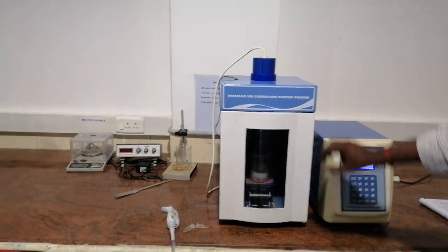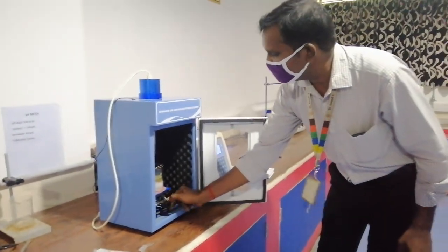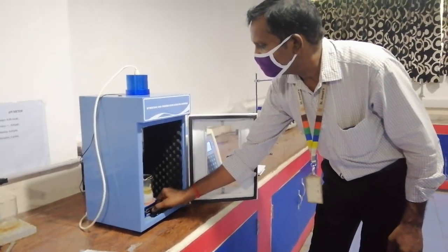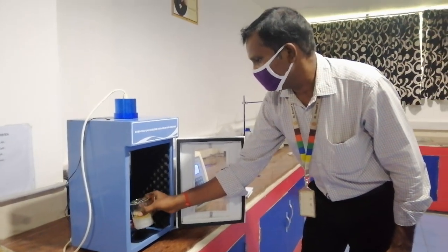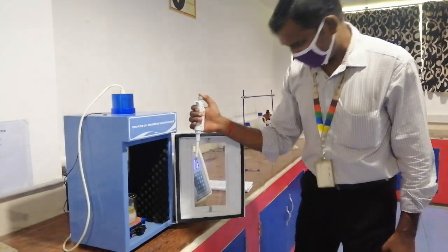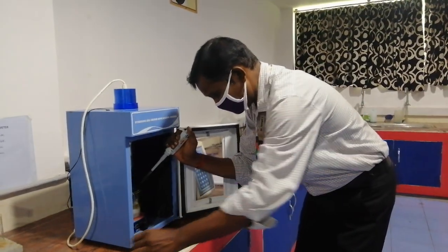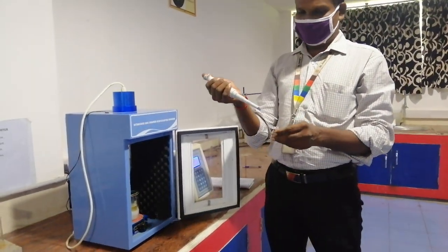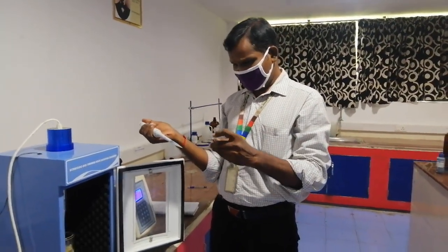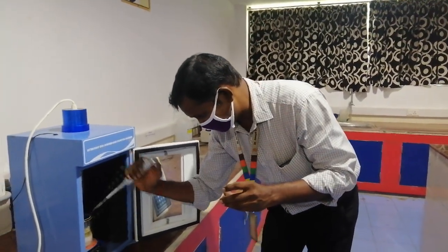Now the second cycle is over. Then open the door and lower the platform. Then take out your sample, or you can simply keep it inside and use your micropipette to collect the sample. So now we are taking the sample for the second cycle. Using a micropipette, you can collect the sample and take it in an Eppendorf tube. Mark it with serial numbers 1, 2, 3, 4: after the first cycle, after the second cycle.